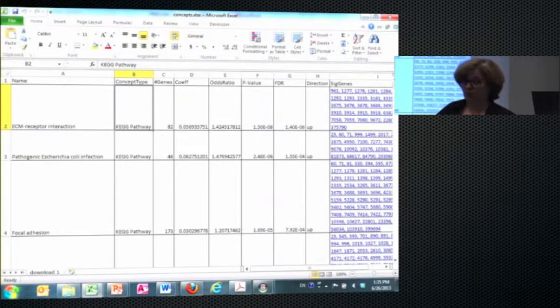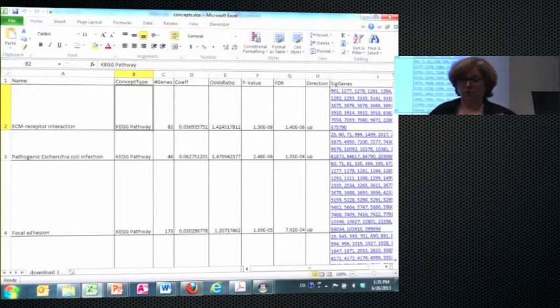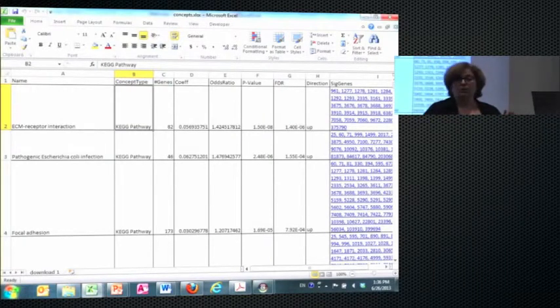If you analyze gene expression data, then you will know that gene ontology terms or gene ontology categories are often used in enrichment testing. These are concepts, and they are entirely valid. It can be anything. We wanted to be able to put in any concepts, not just pathways, and that's why they're called concepts.